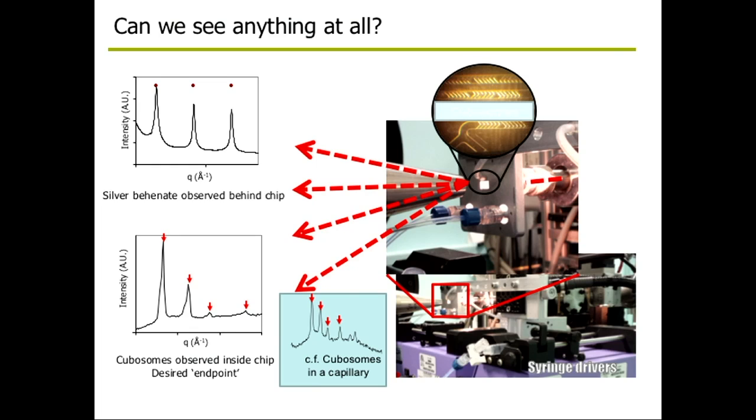So now we've got our hole in the chip, or in the holder, I should say. X-rays coming in, and we can see the Y mixer really clearly in a second. We've got around 100 micron resolution with the beam, so we can sample at 100 micron resolution with the X-ray beam. So the dimensions are matched about right to see what's going on in the channel, right?